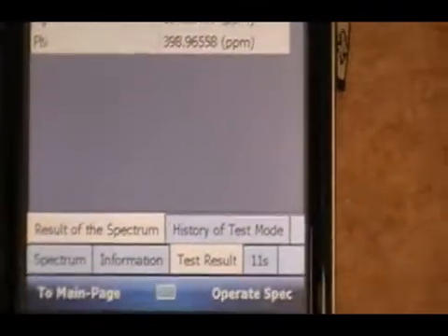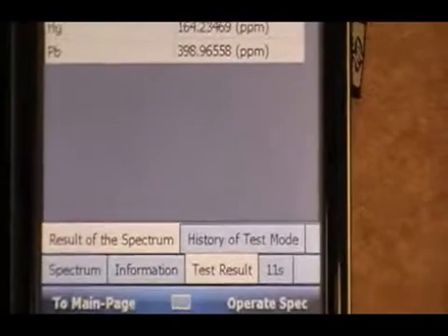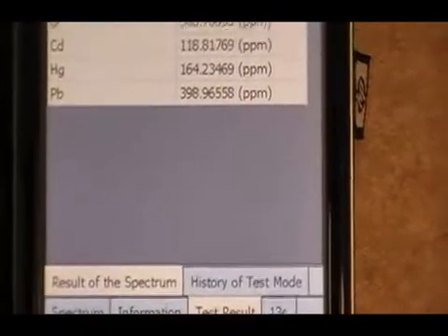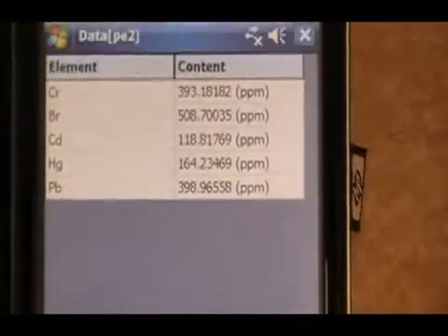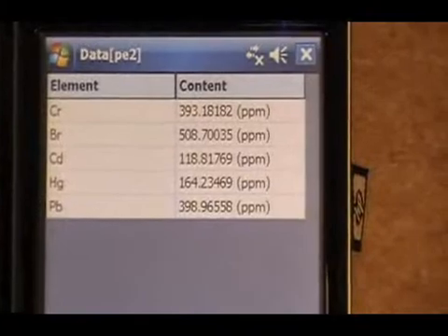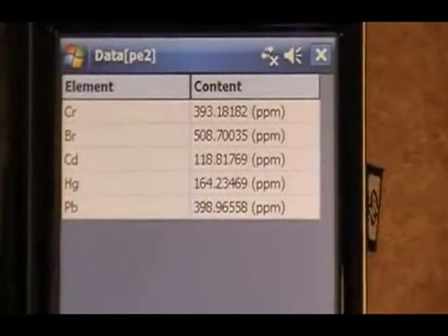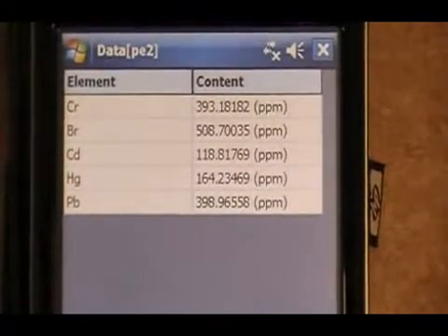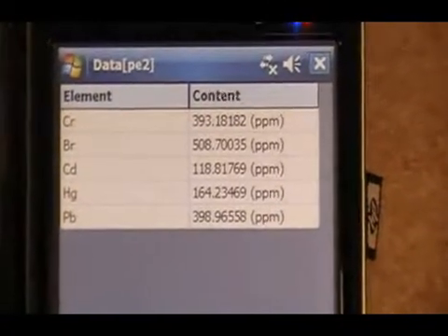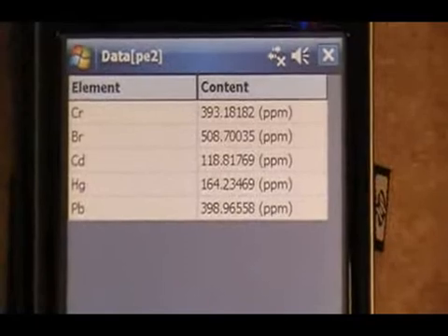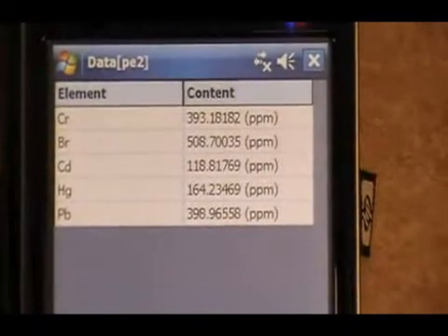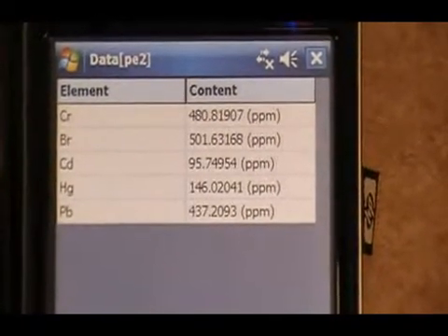This PE low, our first standard. Our cadmium will be approximately 100. Our lead, 400. Our chrome, 400. Our mercury, 200. And our bromine, 500.